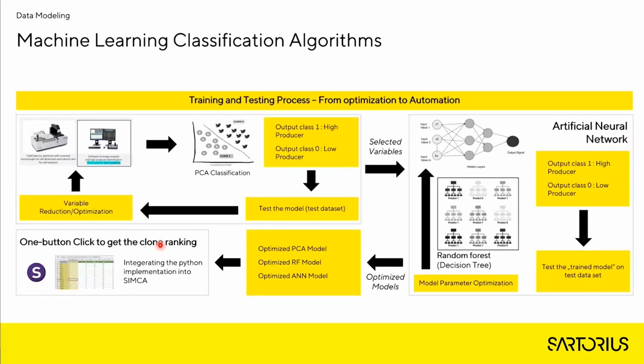So with that, we can go to the workflow of how the model setup, model selection, and machine learning algorithms implementation looks like in our workflow. What I'm showing here is the general workflow of machine learning classification algorithms.